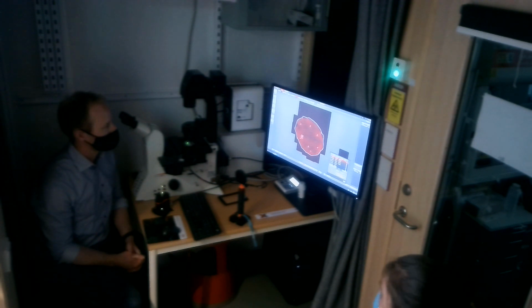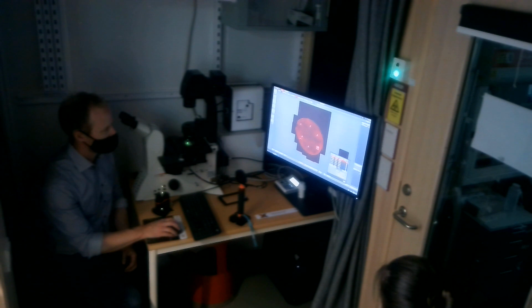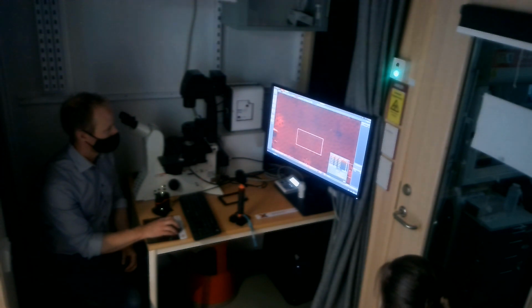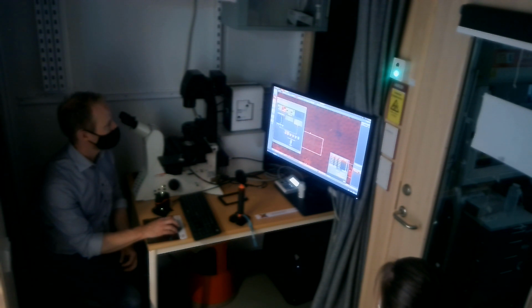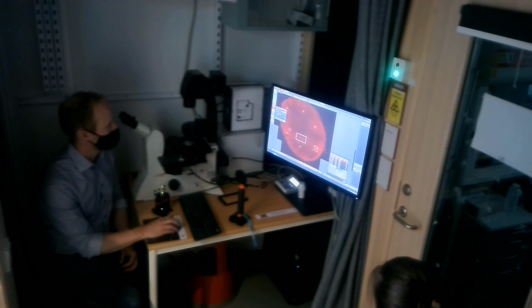But there's a few things that I want to discuss first. We haven't looked at the mosaic merge yet, so we'll have a look at that. We can do that with this sample actually. Remove this. We'll set up a little region of interest. I will remove some of these. So again, this one is not really labeled with anything, so I won't create a really nice one, but we'll do this anyway. Time. Let's remove time so that we don't have anything there. And I will just capture this.